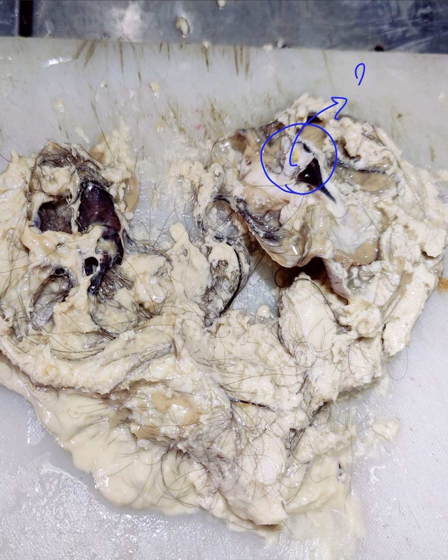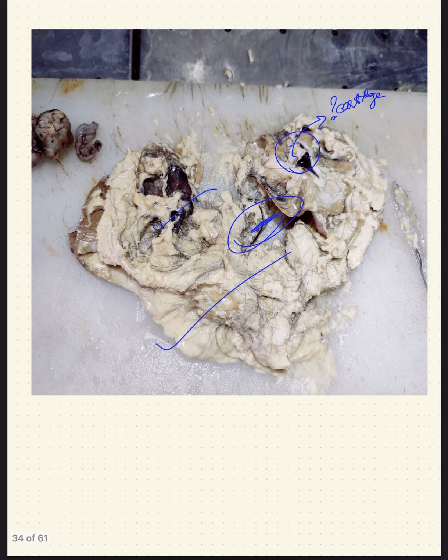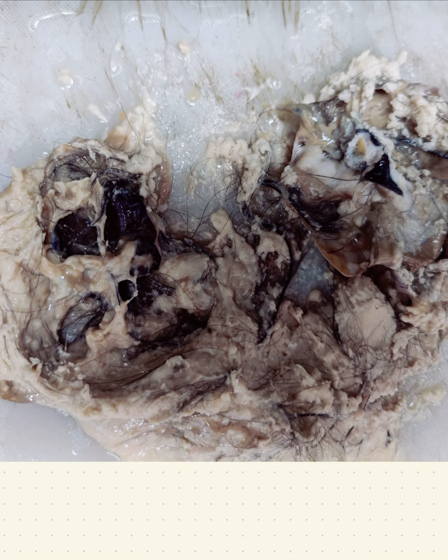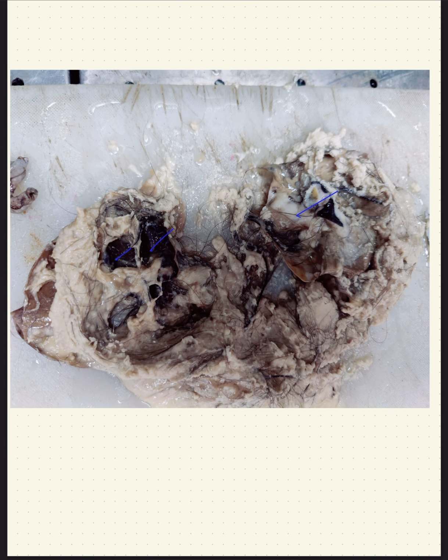So we put it as query cartilage. Grossly, we could identify this greasy material, sebum, large tufts of hair, and this query cartilage kind of thing. On further cleanup, there were dark areas in the cyst wall from where we could take the bits. This greasy material, hair and cartilage is what we could appreciate on gross appearance.